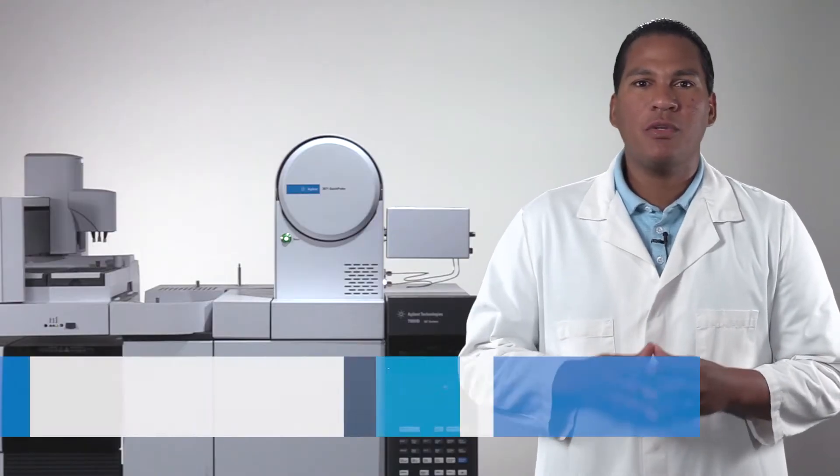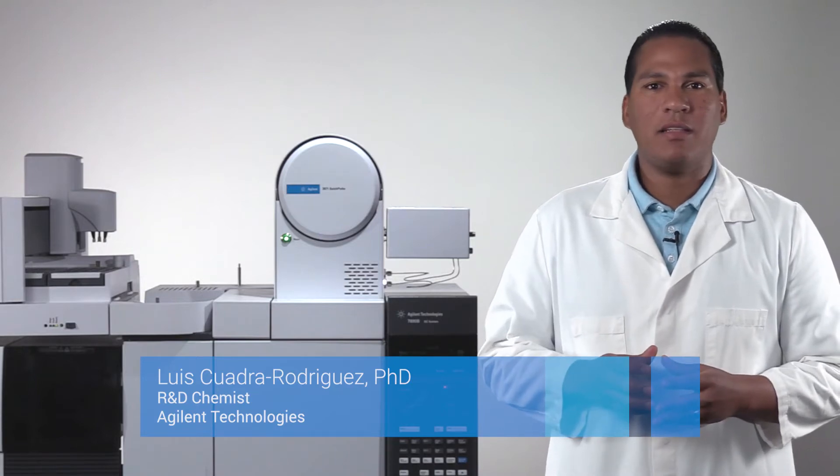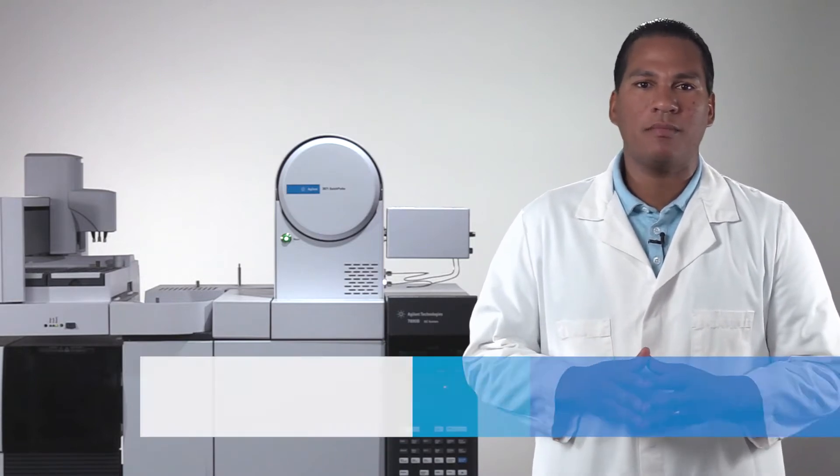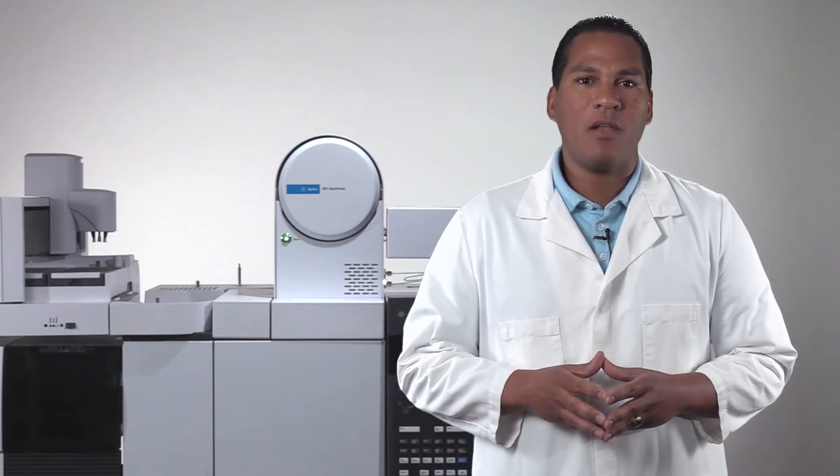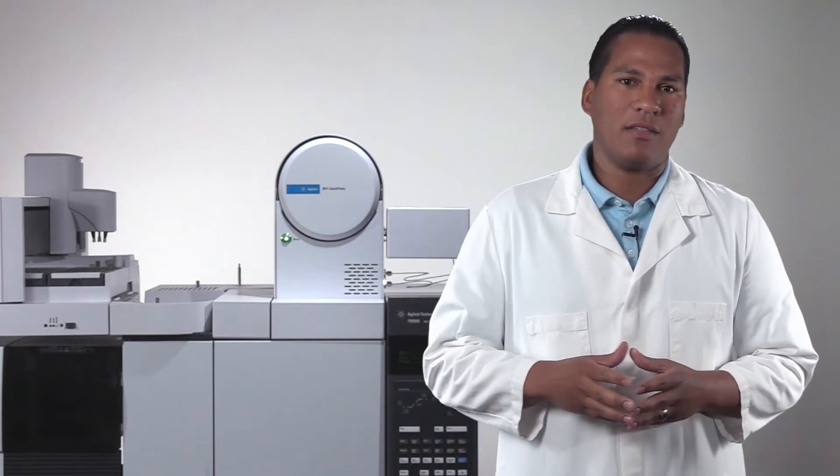QuickProbe includes Agilent's new sample introduction technology that provides rapid heating in the inlet coupled to a short separation column. It interfaces to your standard 7890 or 8890 GC with 5977 MSD for separation followed by quadrupole based mass analysis.